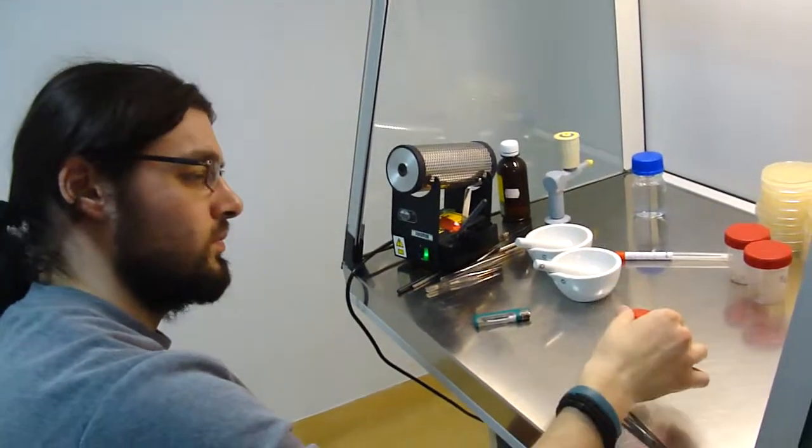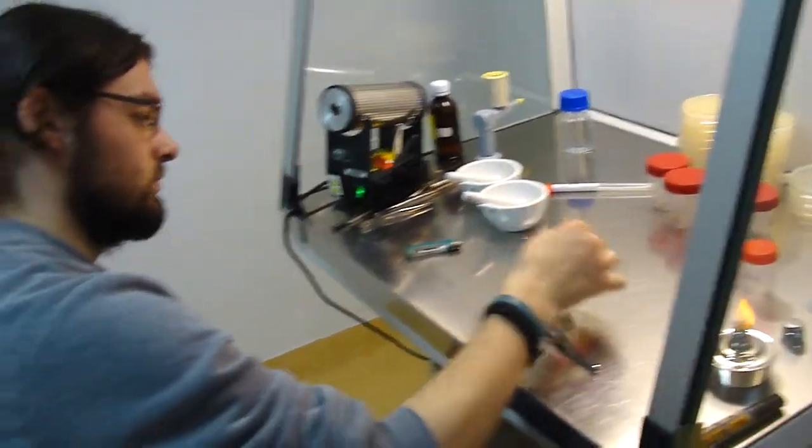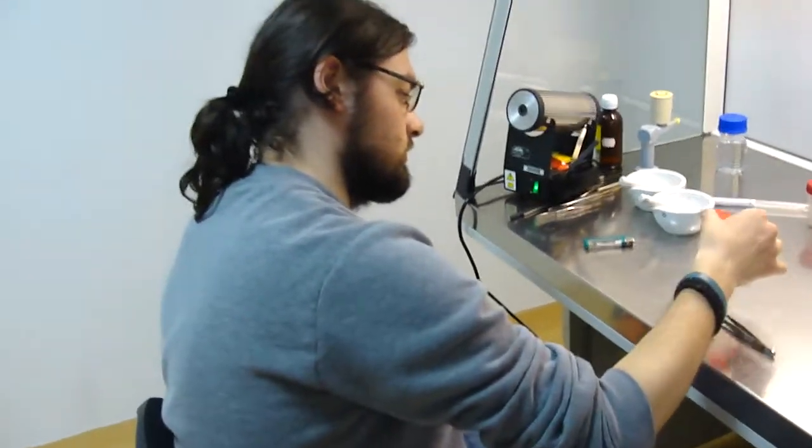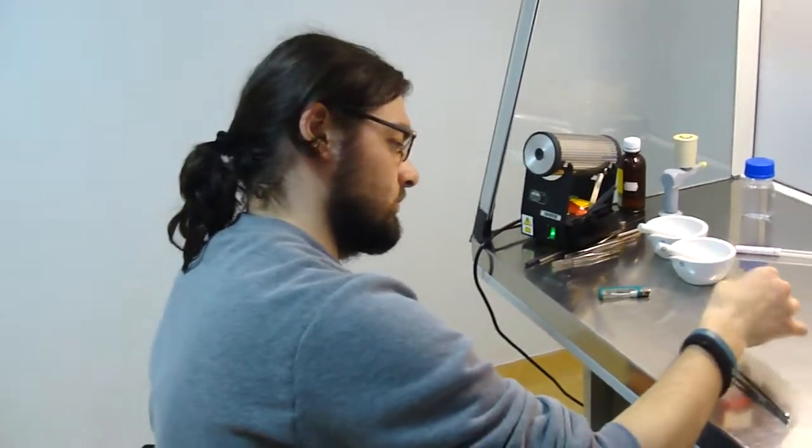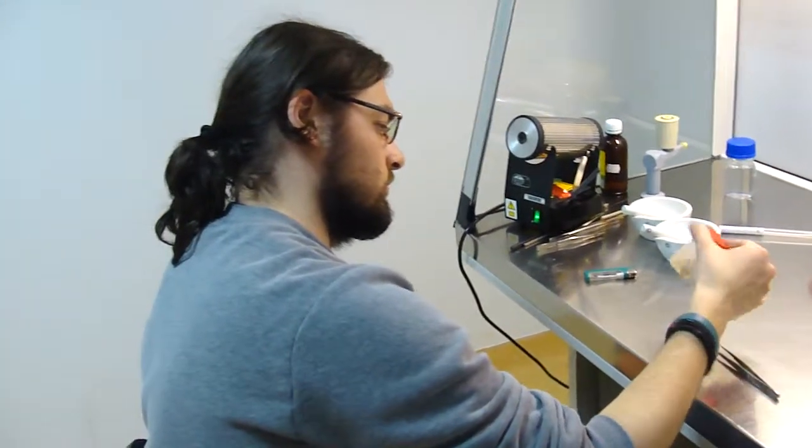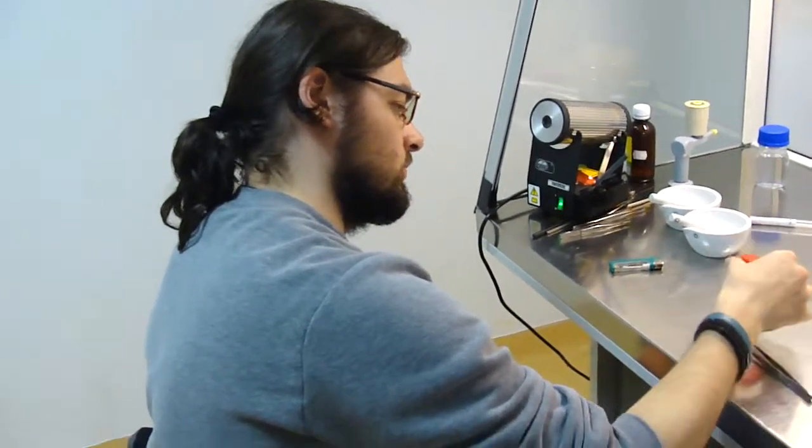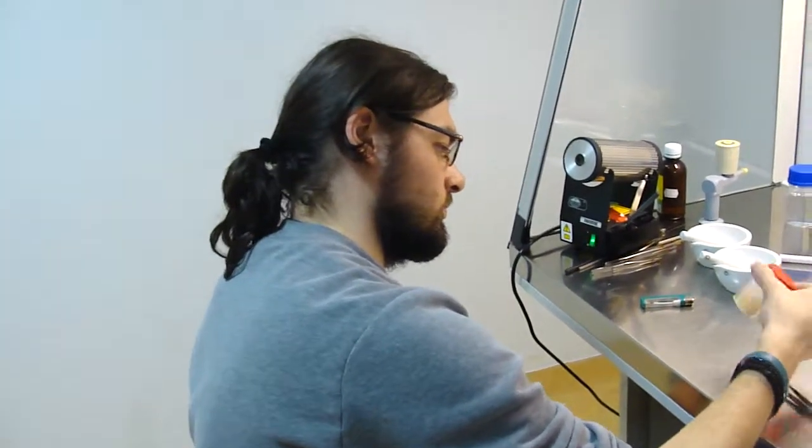It's a xerophilic medium specific for isolation of Eurotium and related genera. Because, as you know, fungi deteriorating rock is a big group of organisms, but their identification depends on how you can isolate it, the type of isolation medium, how you can collect your sample, how you can treat your sample.